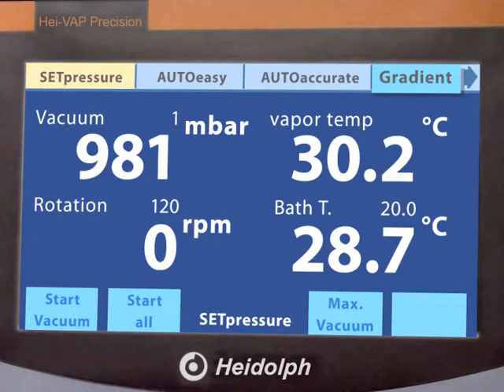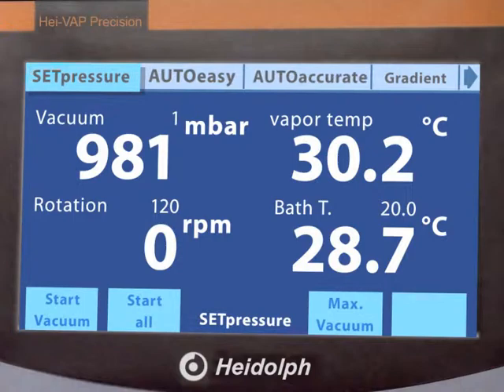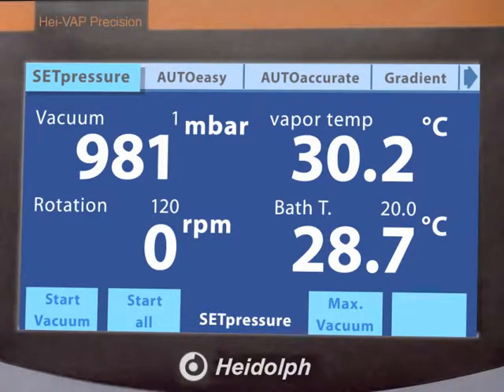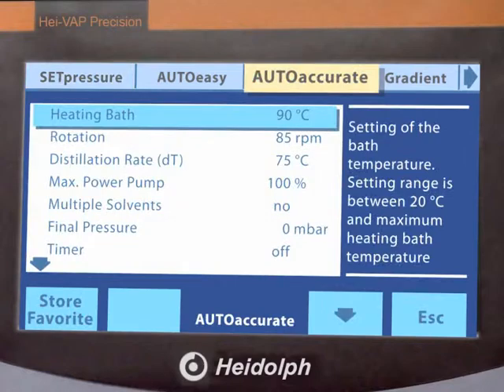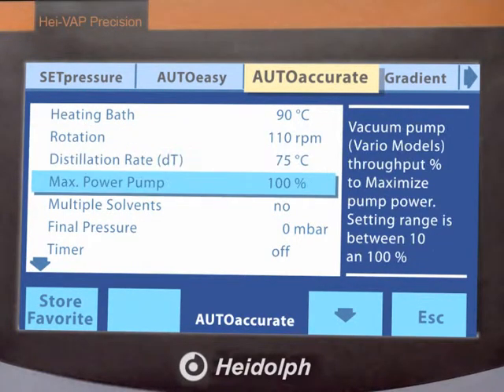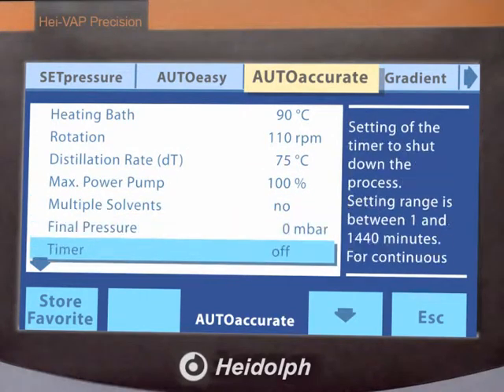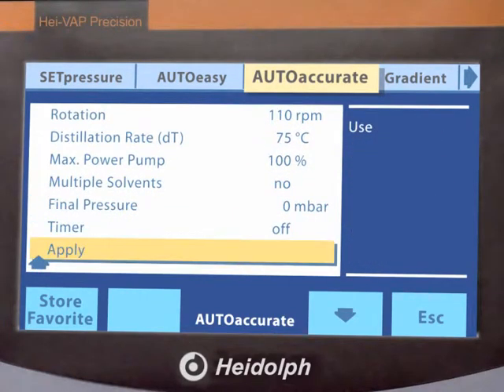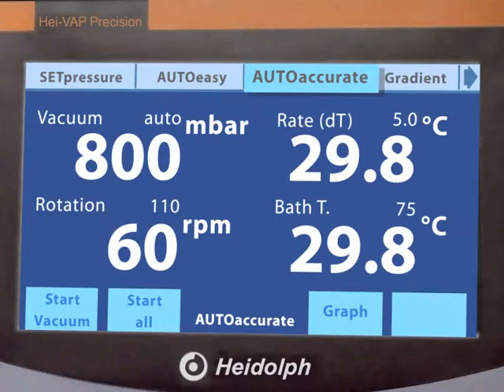The HiVap Precision features three programs, including two for automated distillation. The Auto programs identify boiling points automatically and then hold vacuum constantly throughout the distillation. Manage even the most demanding applications easily and prevent foaming, excessive bubbling or bumping.